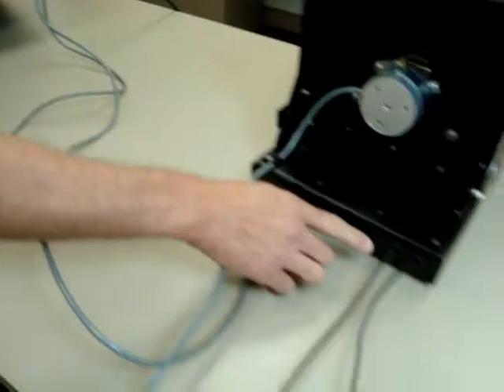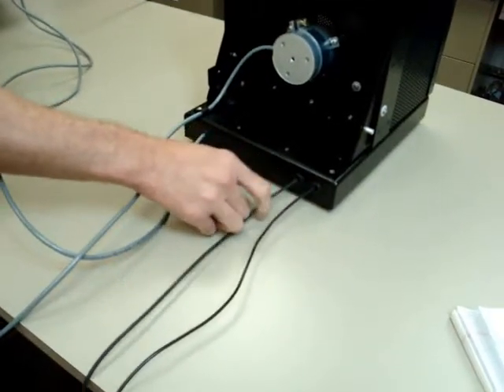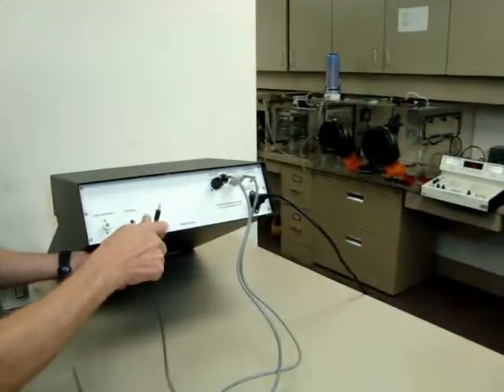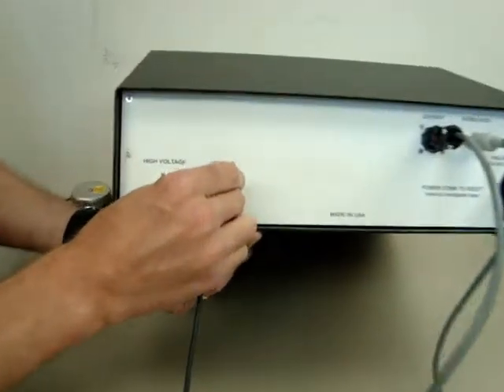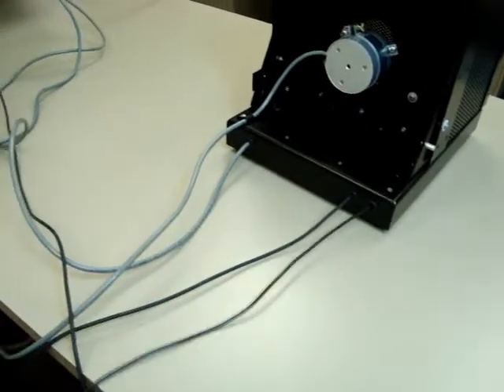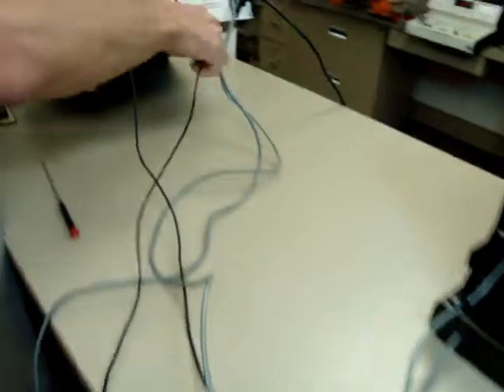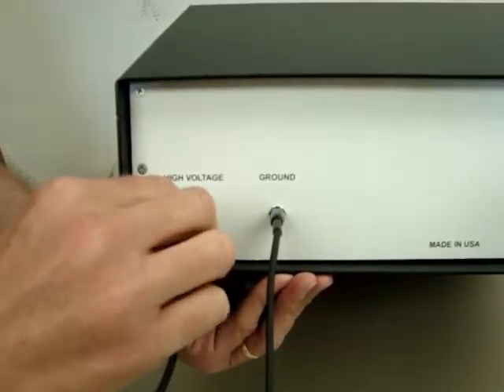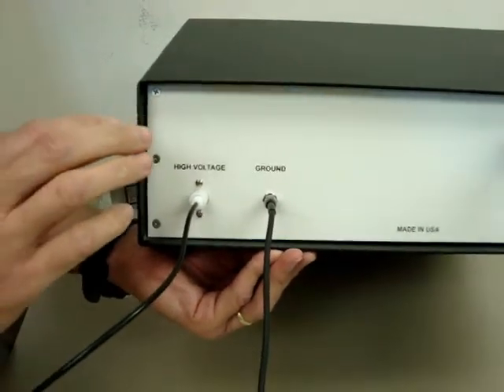Next, we're going to plug in the ground cable, which comes from the cage bottom to ground. Then we plug in the high voltage cable, which also comes from the cage. Make sure this plug goes all the way in and seats in nicely.